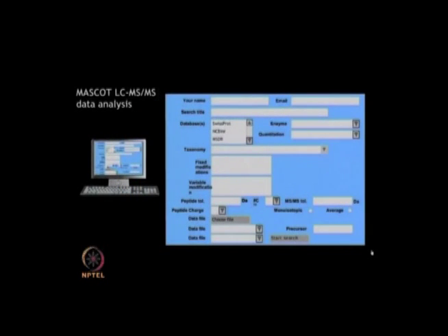The data obtained from tandem mass spectrometry following a SILAC experiment can be analyzed by means of Mascot search engines. The MSMS data analysis software requires input from the user regarding the experimental parameters used, such as enzyme cleavage, modifications, instrument used, peptide charge, etc., and the desired search criteria like taxonomy, peptide tolerance, etc.